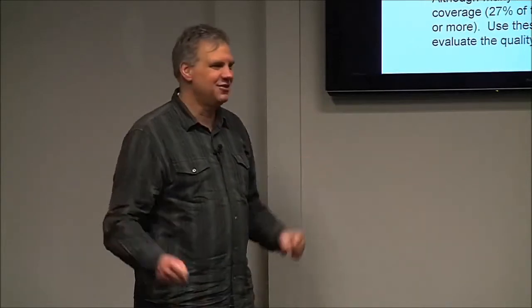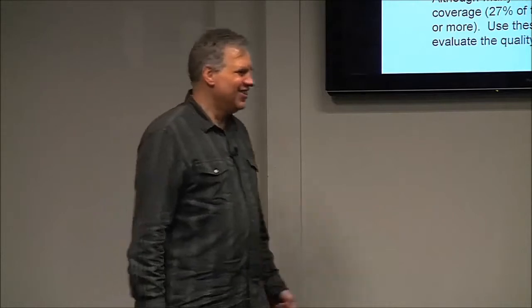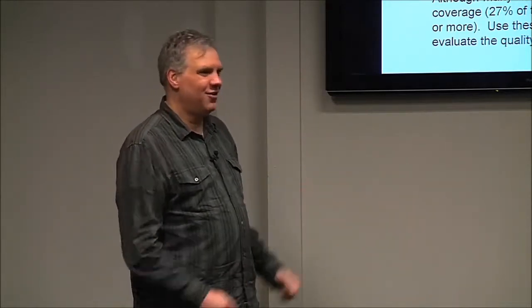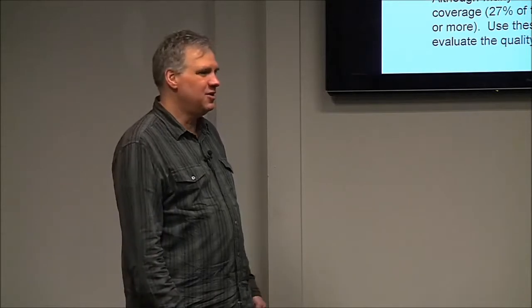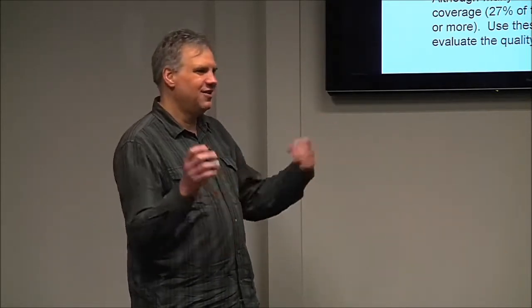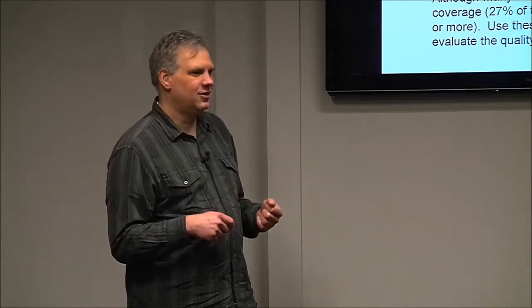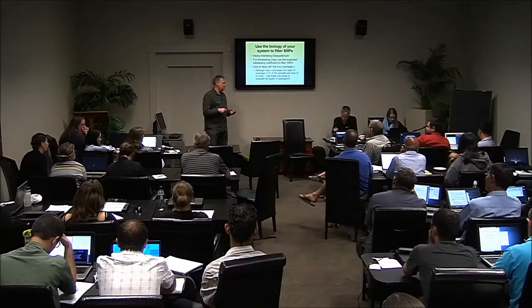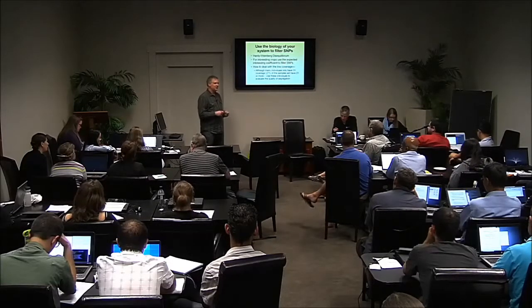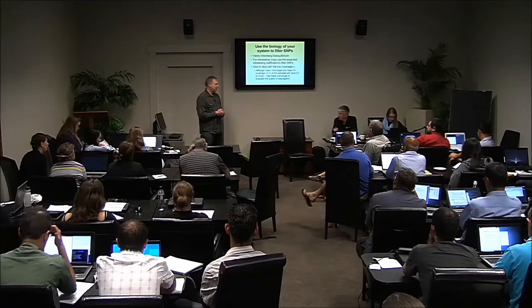So I'm really glad for these questions that help me clarify what I'm trying to say, which is that, yeah, use what you know to help you identify what's a good and what's a bad SNP. Because with GBS, especially in maize, we have all this paralogy and things, so we get SNPs that aren't very good, and we need to filter them out. So with GBS, there's noise in there with the signal, and the cleaner the signal you can get, the better. So use your own biology to separate those things.